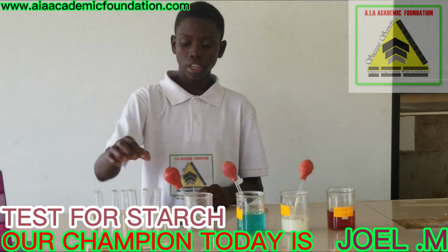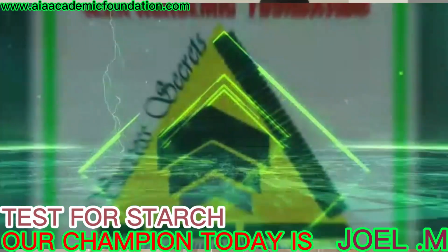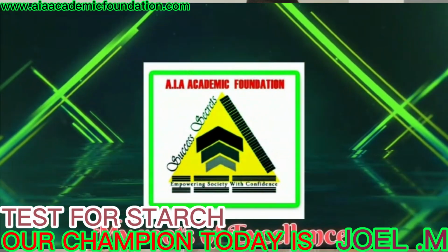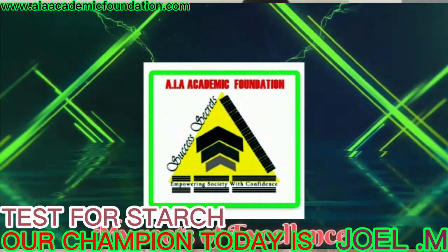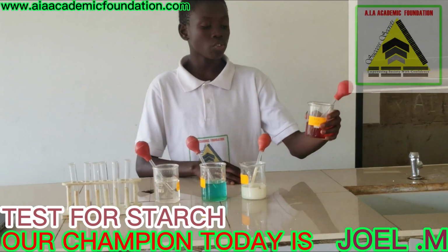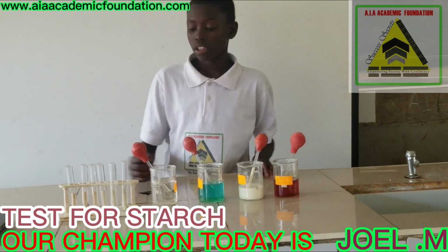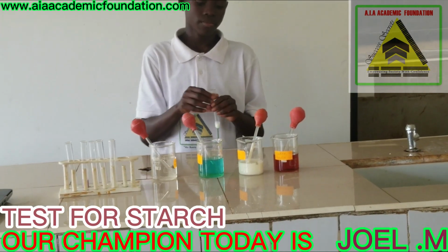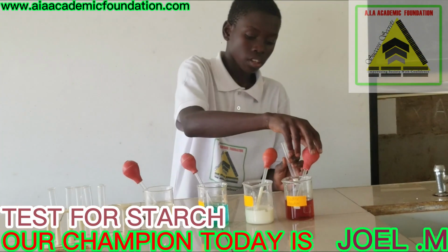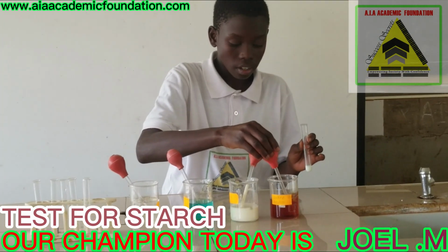So I'll begin by getting 1 centimeter cubed of milk, and add 2 to 3 drops of iodine.